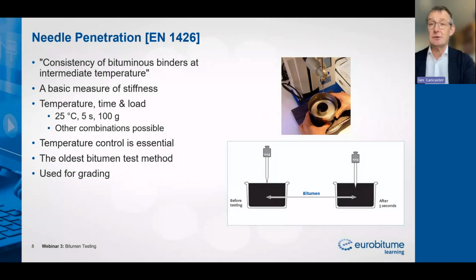And it's the oldest of all the bitumen test methods. It's over 130 years old. And prior to the penetration test being invented by a gentleman called H.C. Bowen in America, there was no real test method for bitumen other than for people to look and feel it.